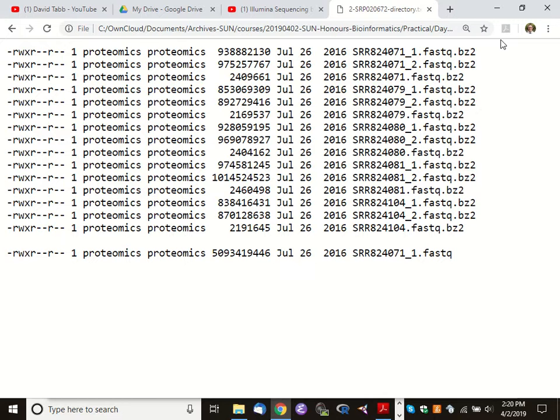So if you were trying to communicate your experiment to somebody else in the file that came back, you could put about 5 sequencing samples on 1 burnt DVD. That's not terrible. Okay, but I want to point out something else about this file. What's all this business back here? BZ2.